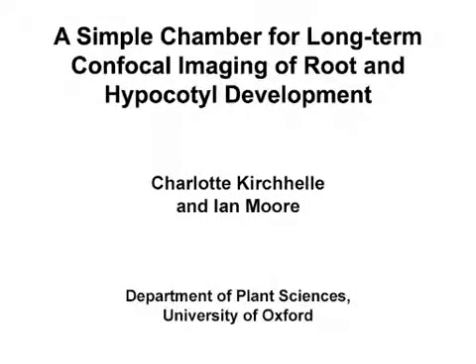The overall goal of this imaging system is to use confocal fluorescence microscopy to observe the development of plant organs over several days at a subcellular resolution. This method can help answer key questions in plant morphogenesis, such as how do cells of multicellular organisms coordinate their patterns of growth and proliferation during organogenesis.